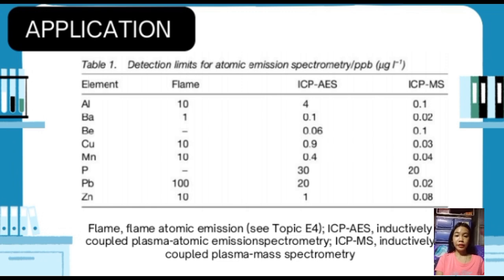By collecting water samples and analyzing them using ICP, students can gain insight into the pollution levels in their community, informing both local stakeholders and policymakers about potential environmental hazards.